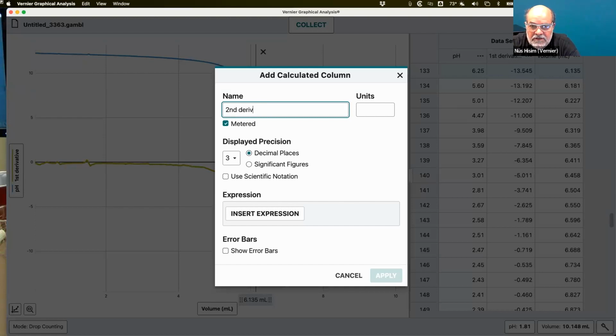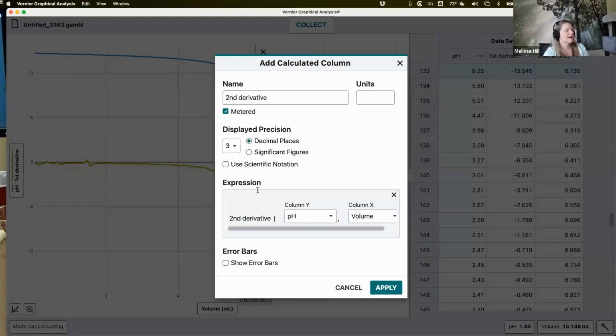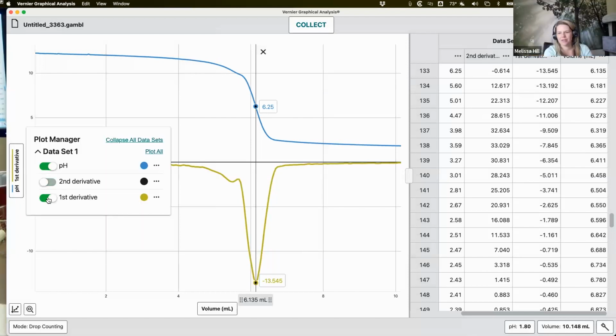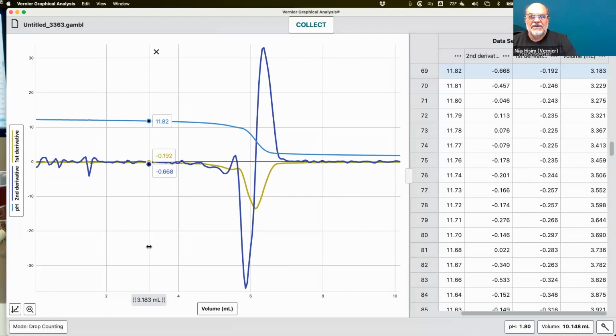Melissa, how's it going? Doing good. Got some comments about the error bars, and the AP uses them a lot too, so I'll turn them on. Yeah, I mean, there's a lot of points here. This isn't a great example for using the error bars, but for Boyle's law, Beer's law, I love the new error bar feature. It's really nice. In this one, it's going to be pretty messy. There are going to be too many points.